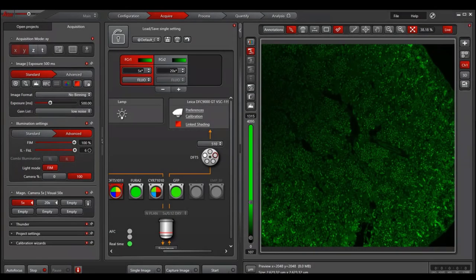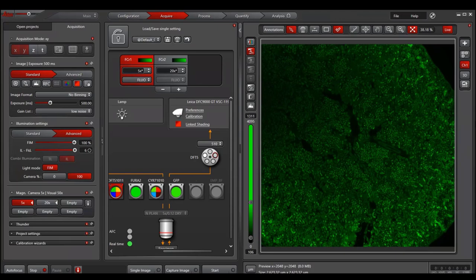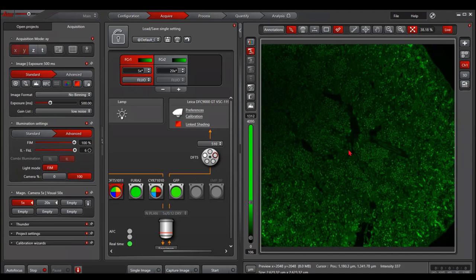Sometimes we use a lower magnification to find the sample, then switch to higher magnification for imaging. In this case, I found a sample with 5x.